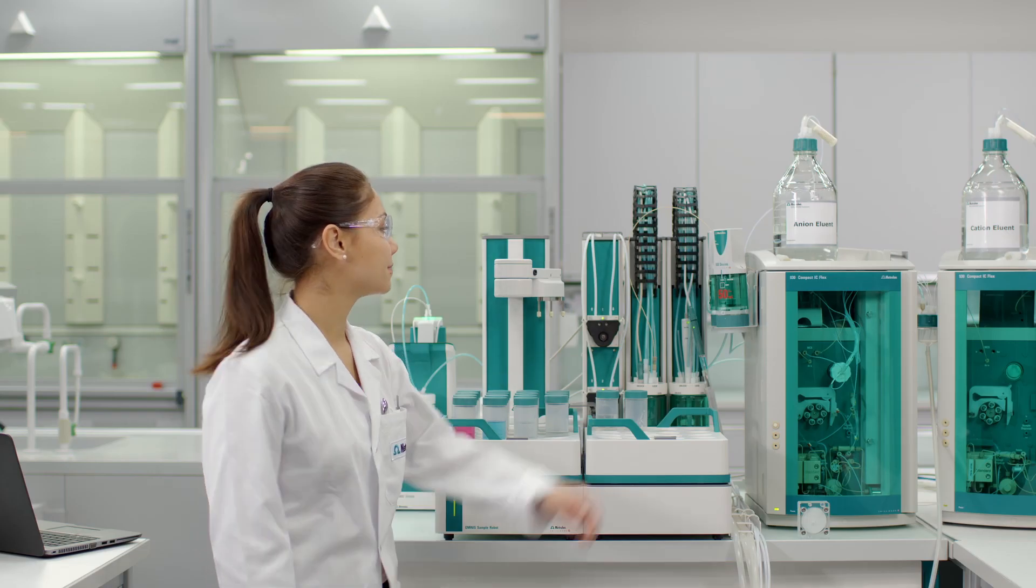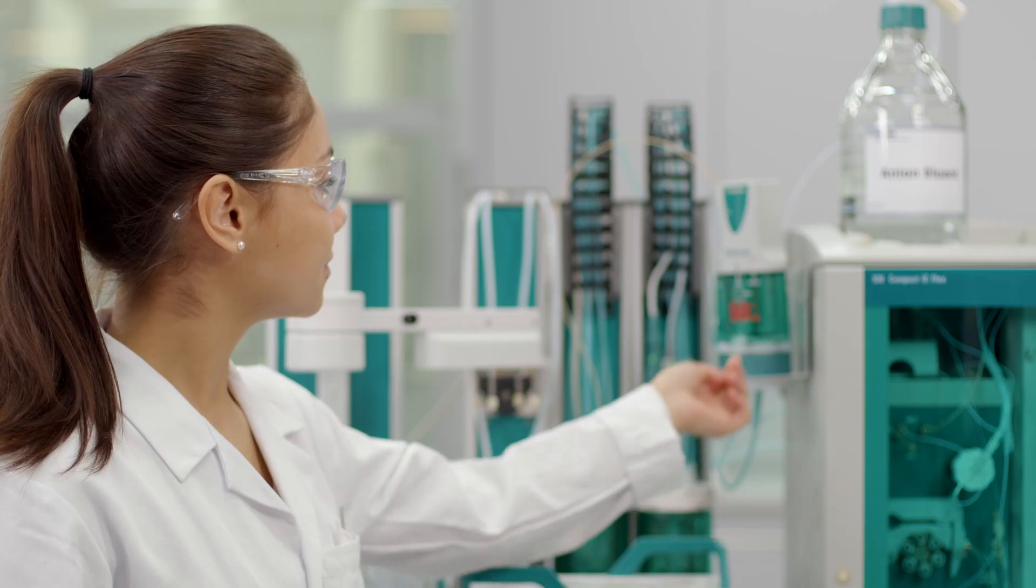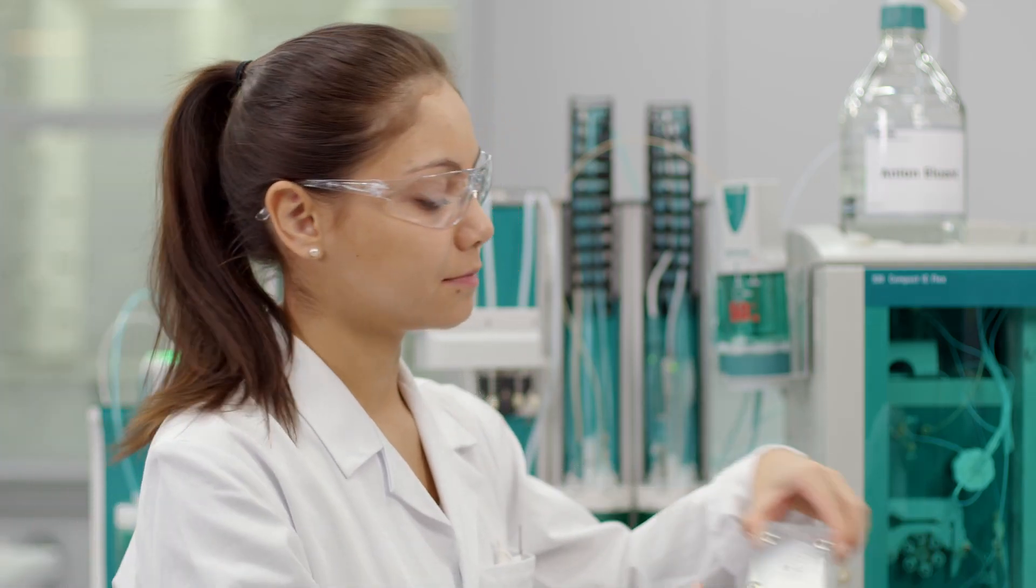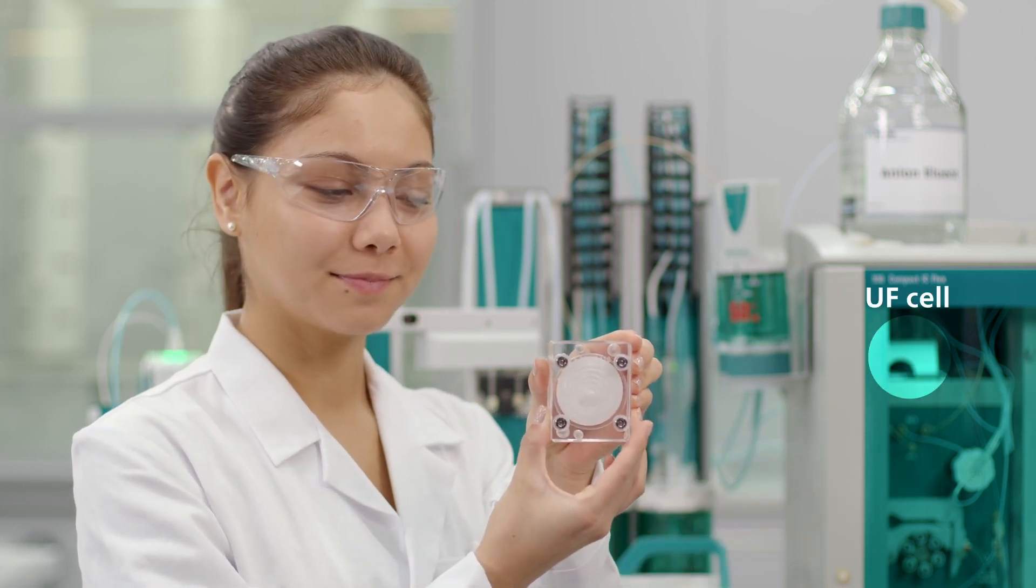Accurate sample handling is done automatically with intelligent dosing units. Inline ultrafiltration is used to protect the IC from particles that can be present in samples.